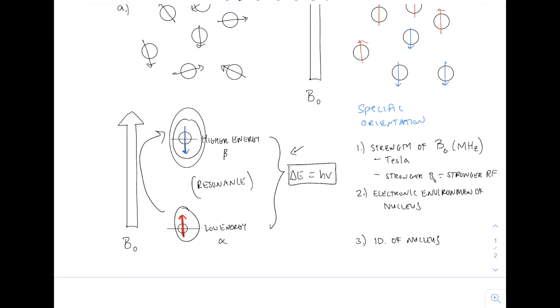So in short, they are affected by the magnetic fields of the adjacent nuclei. Structurally, every organic molecule is going to be different, and so every organic molecule is going to have a unique magnetic environment for each of those nuclei. That's why NMR is so useful, because we will have a very unique NMR spectrum for each molecule.